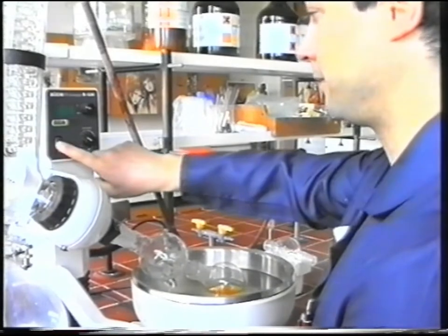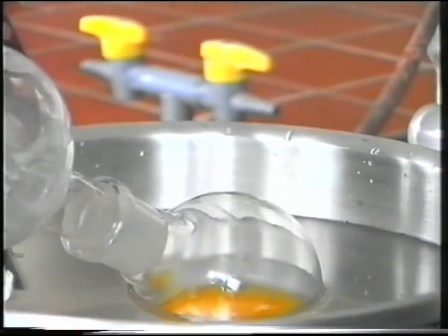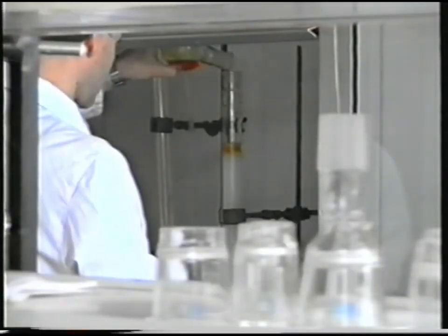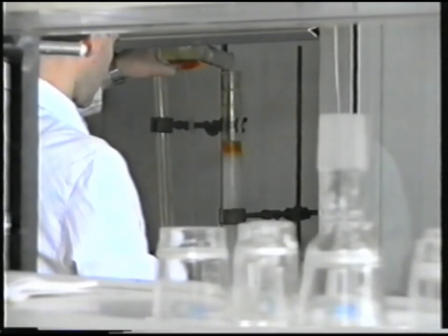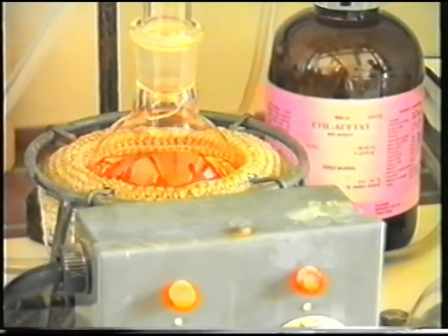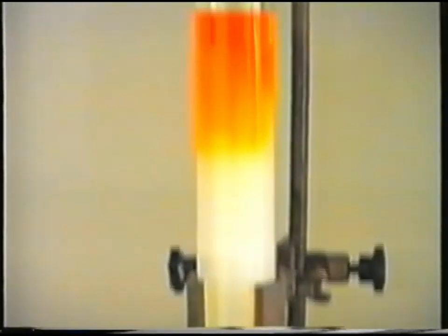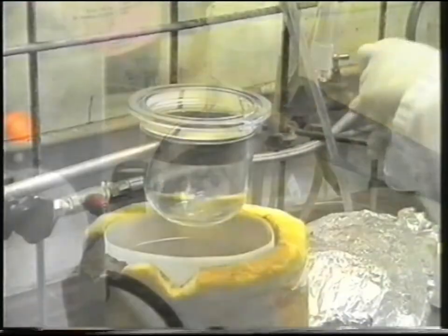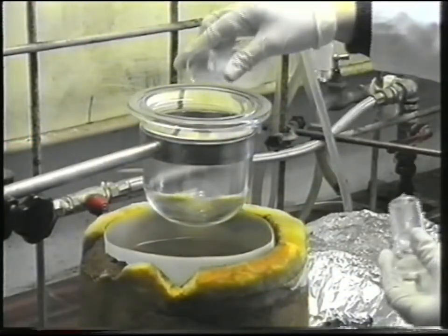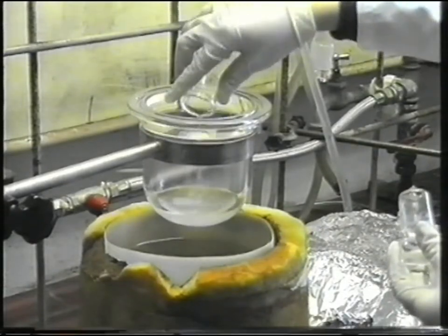In the laboratory we conduct research on the synthesis and characterization of synthetic polymers with special properties and predictable structures. Polymer properties depend on the synthesis route and the subsequent processing of the materials. This places special emphasis on research into correlations between polymer synthesis parameters and their structures and properties which require substantial knowledge and modern research equipment.